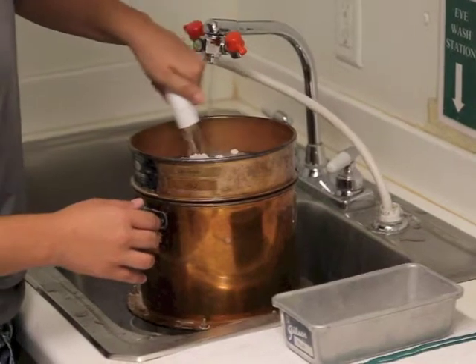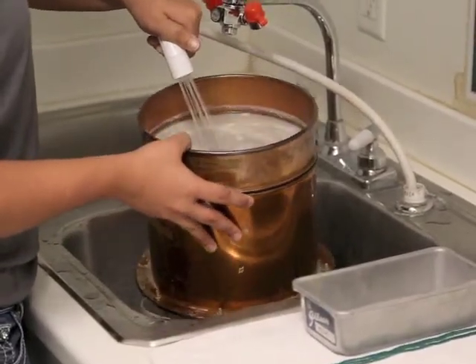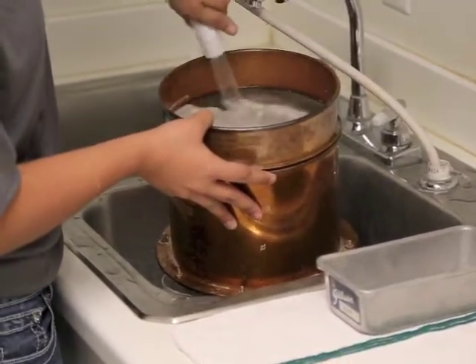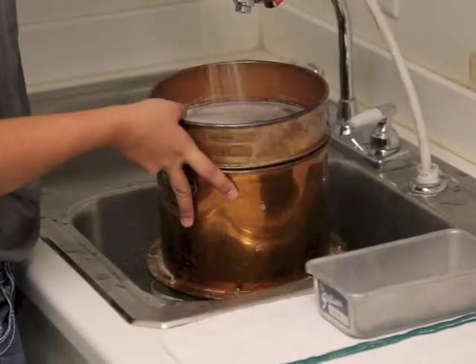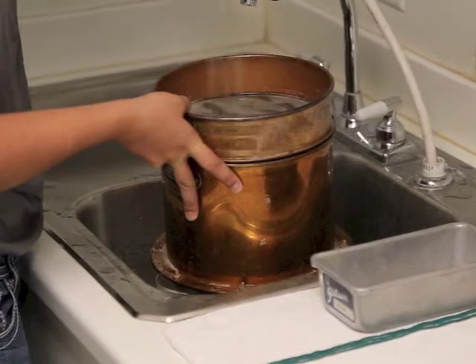The sieve shall be held over a sink at an angle of approximately 30 degrees from the horizontal. Using a small bath spray at moderate pressure, first wet the entire surface of the sample. Hold the spray about 6 inches from the sieve and, starting at the upper edge, gradually wash towards the lower edge, washing small portions of the sample through the sieve.